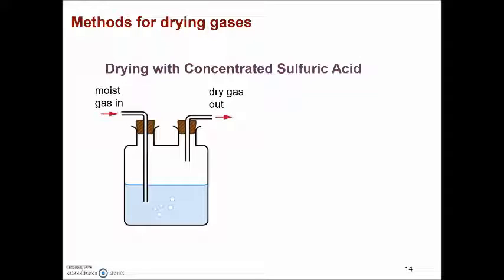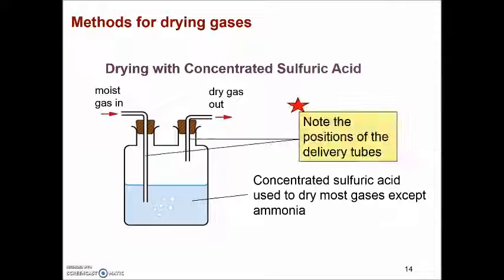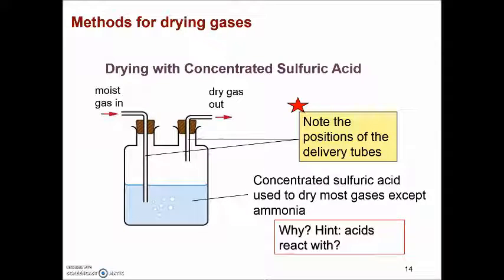As it's a solution, the gas has to be bubbled directly into the solution. It is suitable for most gases except ammonia. Now, why do you think this is so? Think about acids. What do acids react with?